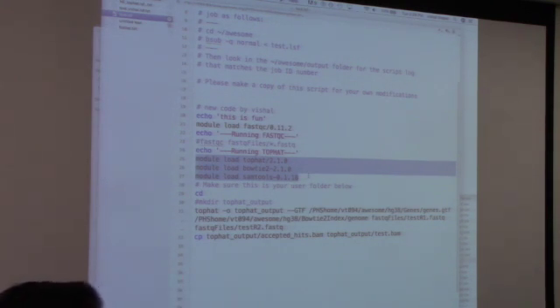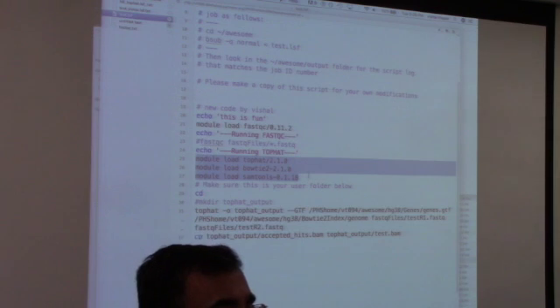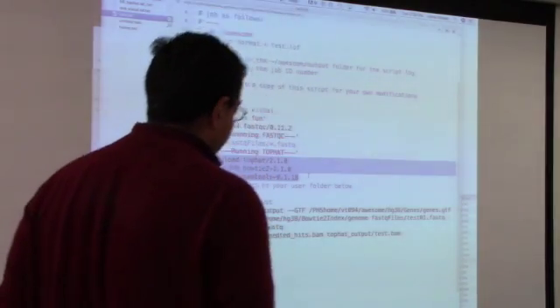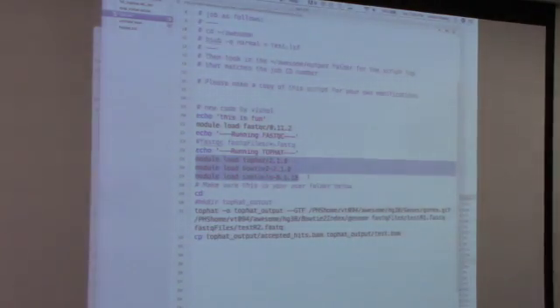It's still saying permission denied when trying to copy the file? Maybe I have it wrong, but data MGH is not the one. You're in temp MGH CC. Oh, I'm sorry. cp -r temp. Yeah, that's the one that needs to change from data to temp. It's just really slow. Yep, TMP. Enter. Boom.